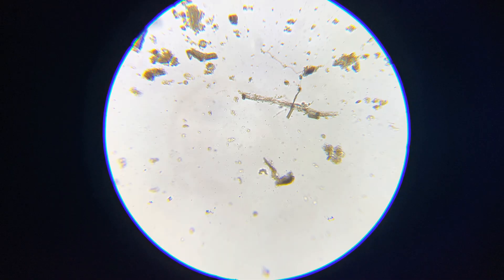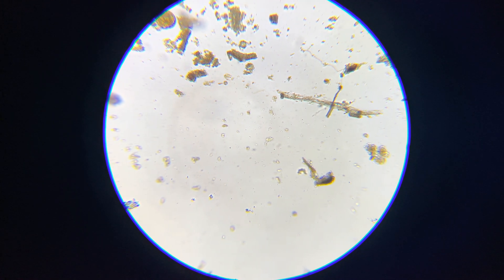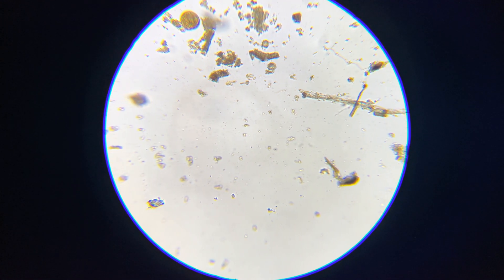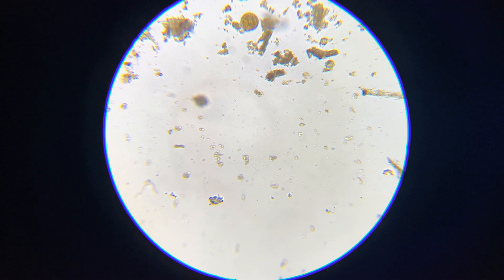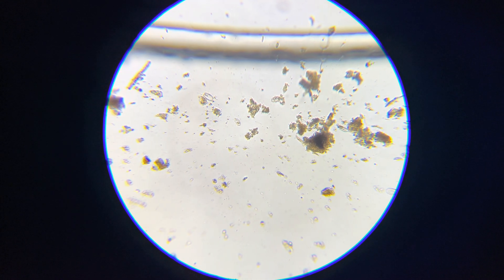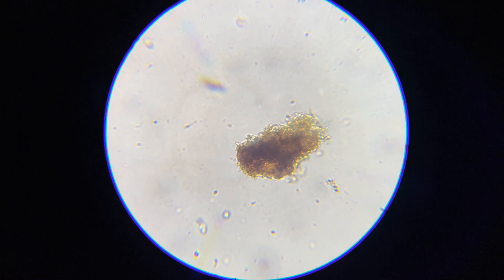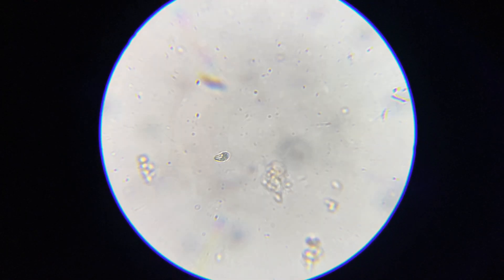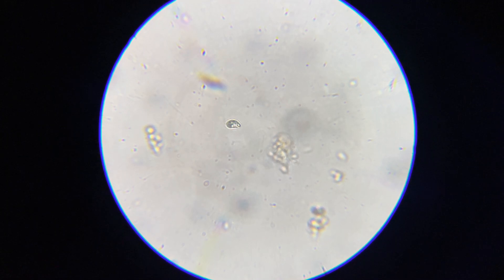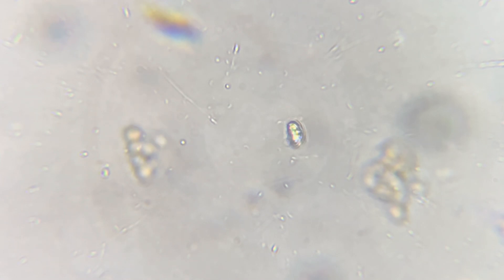Now what do we find with the worm leachate liquid sample? At first look, I do see a lot of activity under the microscope — a lot of little creatures swimming around real fast. There's Arcella up here, which is a good sign. You see a couple of testate amoeba, also a good sign. Those are the predators that we want to see. But I do see a lot of ciliates — quite a few actually. Here's one that is gobbling up all the bacteria around it. You can see those little hairs off the sides spinning around, moving bacteria into its location so it can gobble them up.